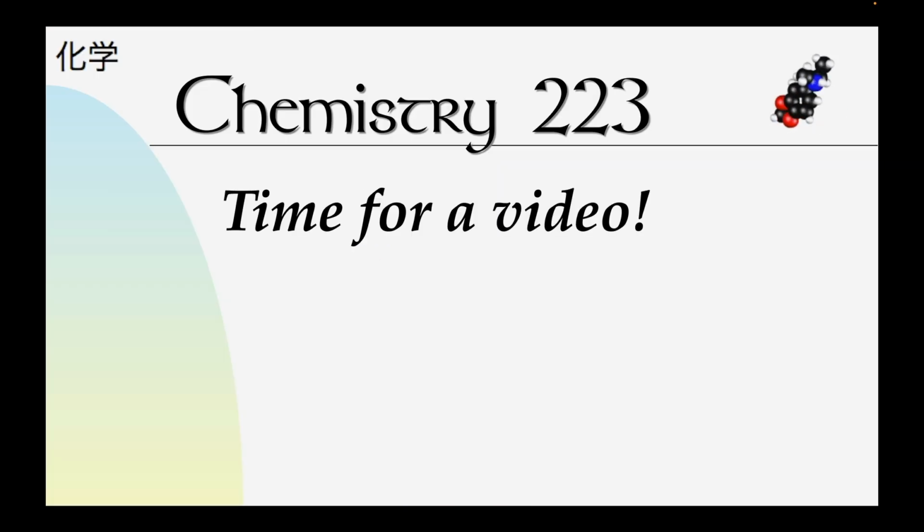Okay, at this point, I'm going to show an example of how the LabQuest system works. You can watch and see and know what to predict that way when you go into the lab yourself.